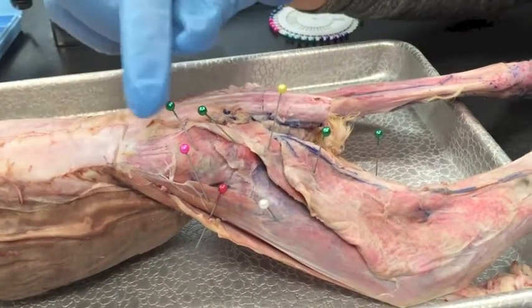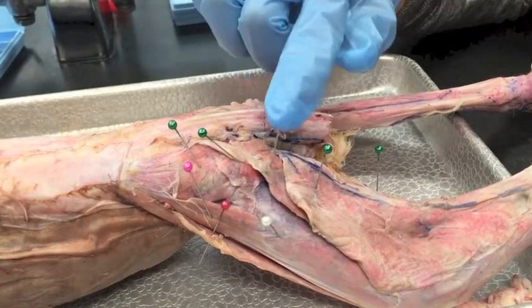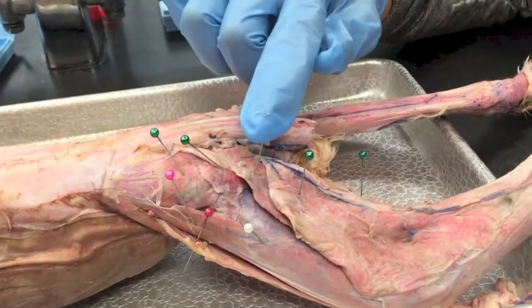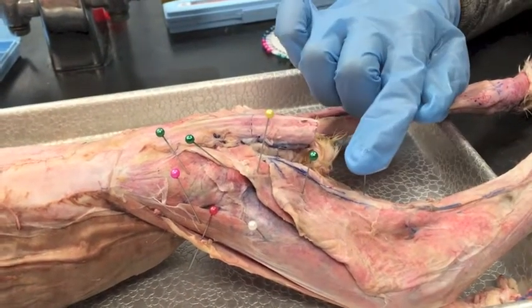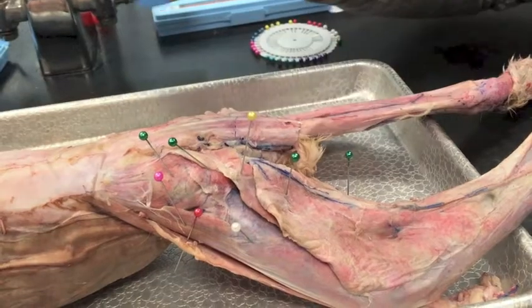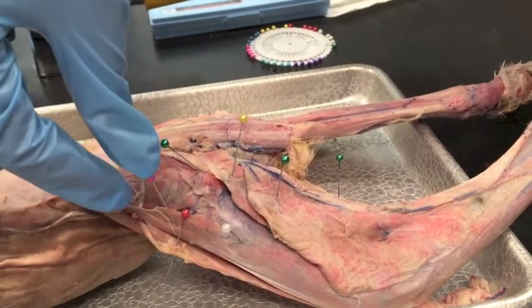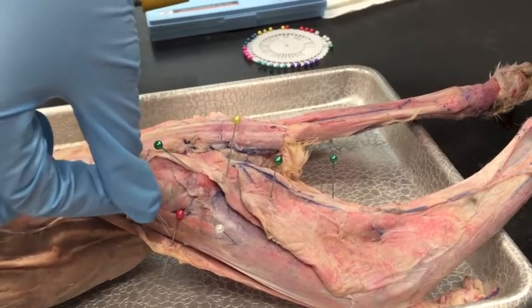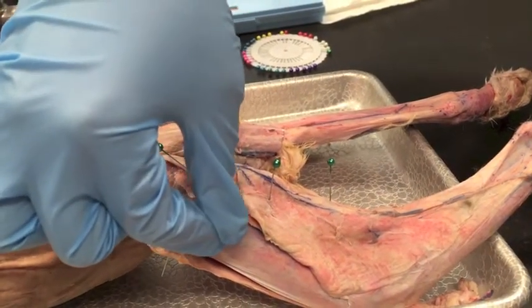Sacrospinalis, gluteus medius, gluteus maximus, and the caudofemoralis, biceps femoris, semitendinosus, we have the sartorius, the tensor fasciae latae, and the vastus lateralis.